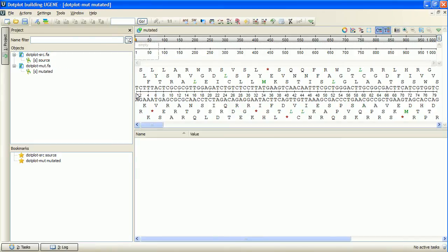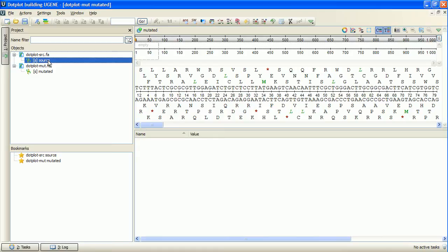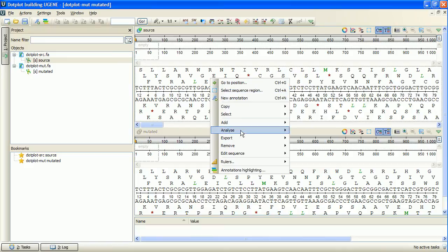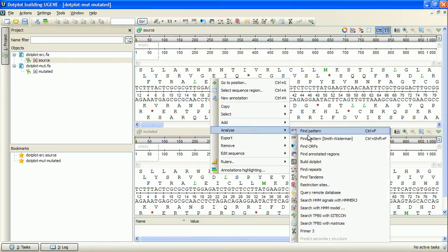The mutation is created artificially to demonstrate dotplot usage. To compare the sequences, I will drag one sequence object into the view of another to create a multiple sequence view that will contain the sequences to compare. Now I right-click at the view and select Analyze, Build Dotplot.